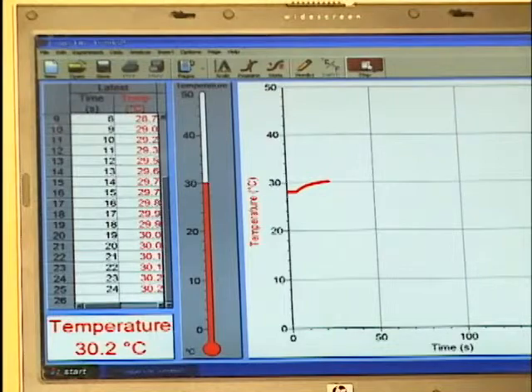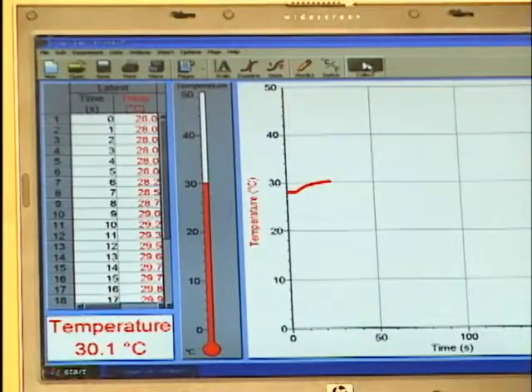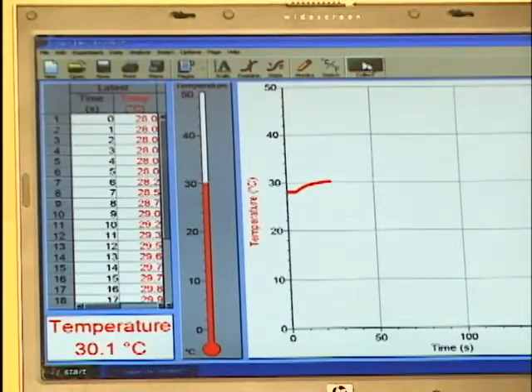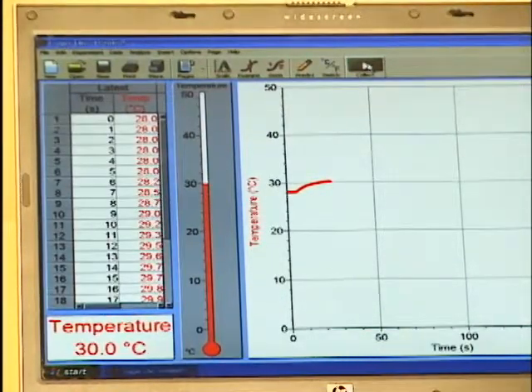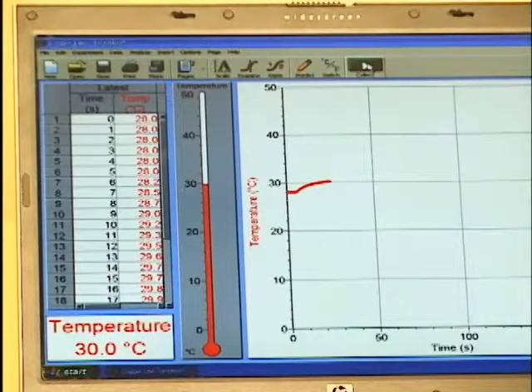When our experiment is complete, click on the Stop button, and the data is ready for further analysis or to save to a file.